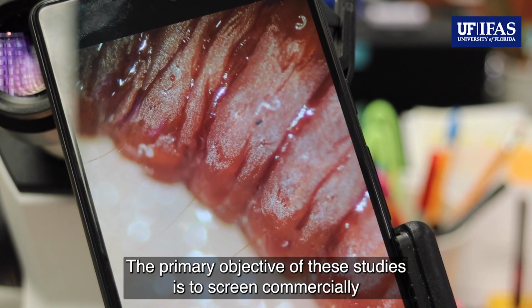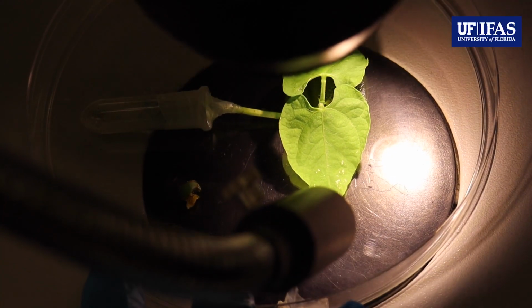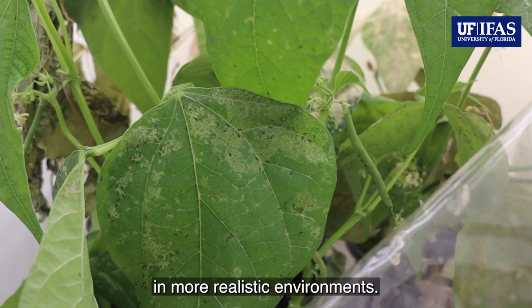The primary objective of these studies is to screen commercially available biological control agents for their potential use against Megalurothrips usitatus. This serves as an initial step before testing their efficacy in more realistic environments.